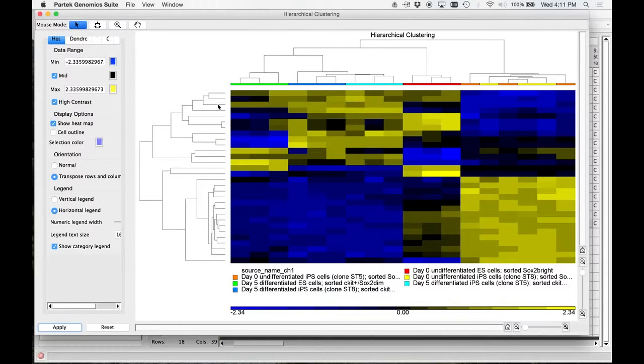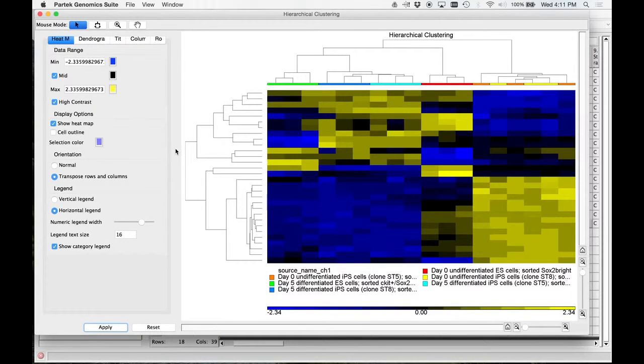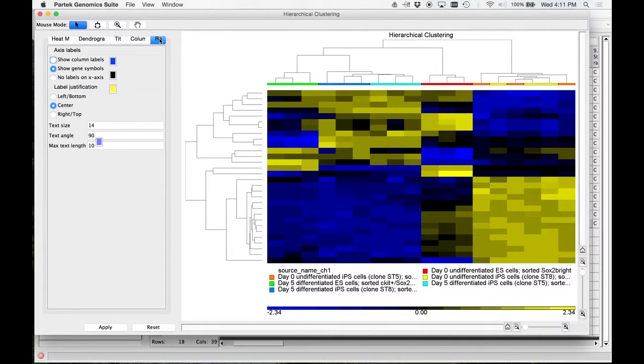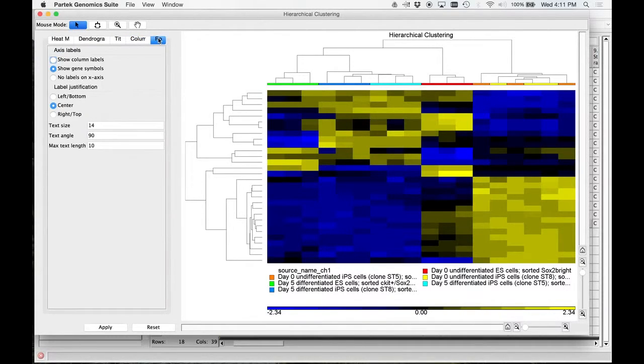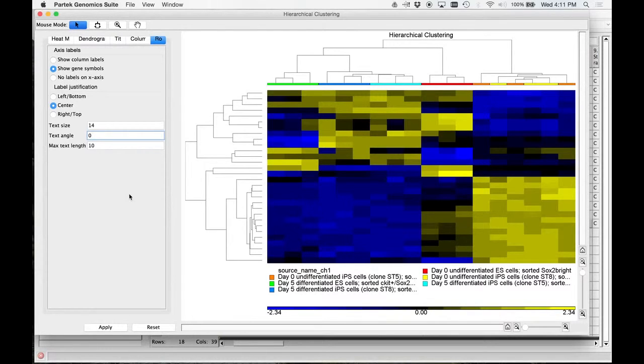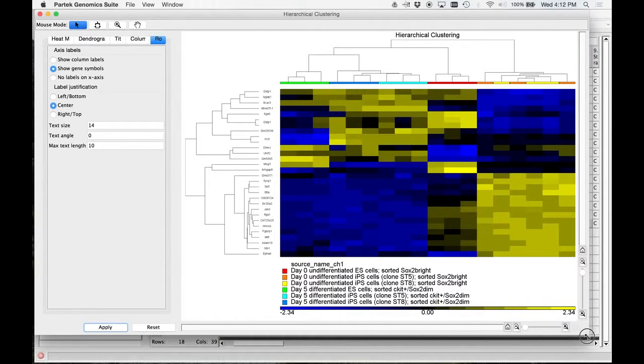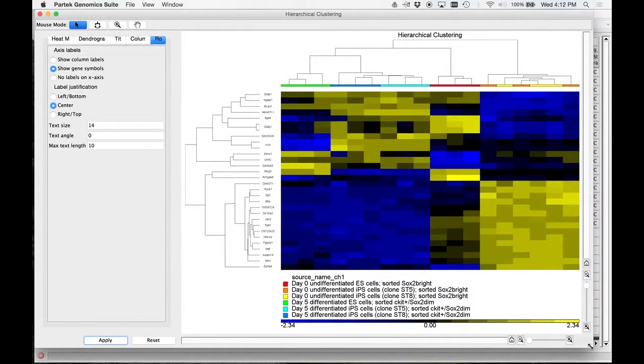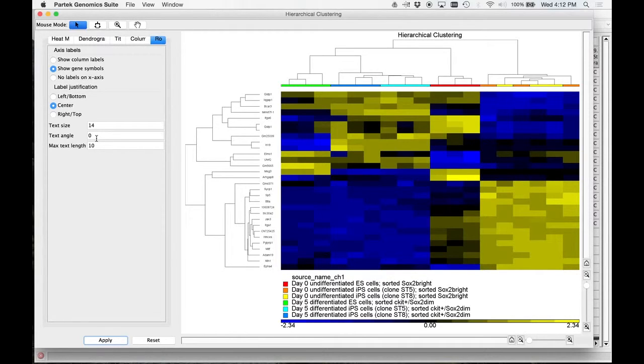You can see these genes and actually what we can do - let me try this. Go to row. Show gene symbols. Now here's a problem. I think it's trying to do it at the wrong angle. Go zero for text angle. Now hit apply. There they are. Did that work for everybody? For text size you did 14 and text angle you put zero. And show gene symbols.